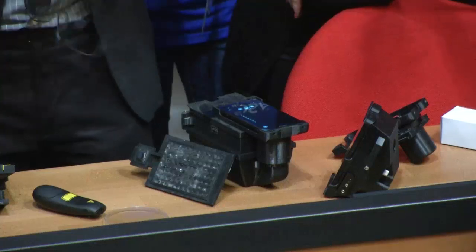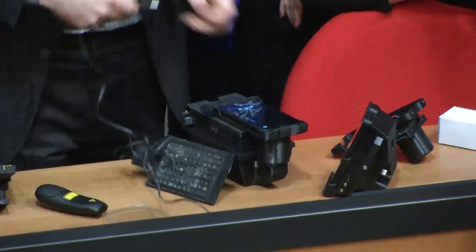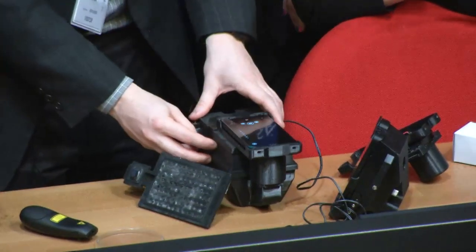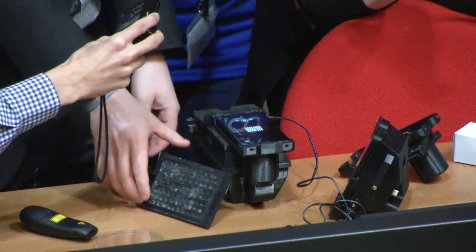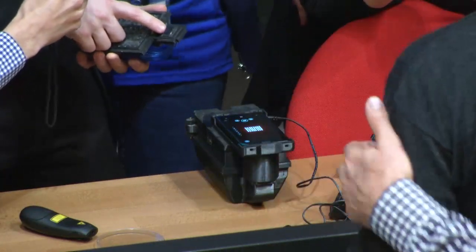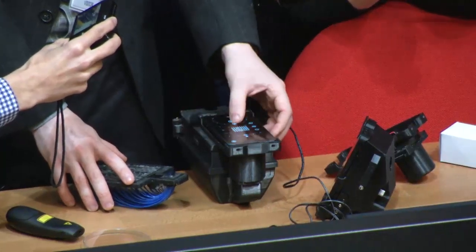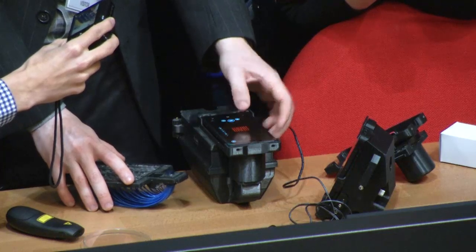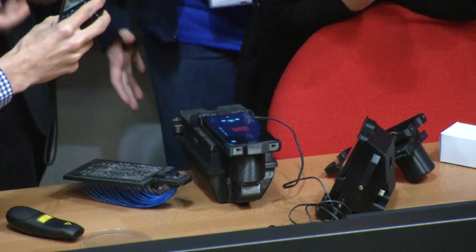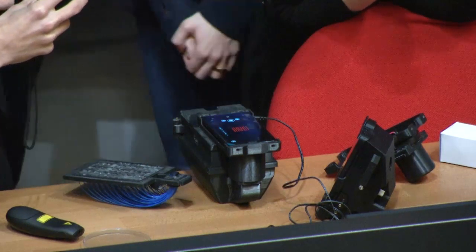So here, plug it in. Turn it on. So we actually use red illumination here. And now what you're seeing here are these ends of the fibers. Each fiber is coupled to one of the wells in the ELISA well plate. And then again, need to mess with the settings. But here, this is the image we process. And if there was a biotarget you were looking for, malaria, something like this, one of those would be very dim. And that would correspond to a very high absorbance because of the enzyme-linked immunosorbent assay going on.